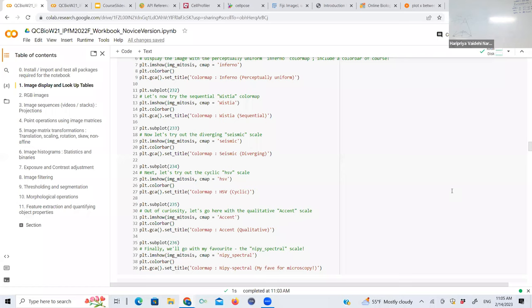Like if you wanted the pixel values to change, because sometimes in a pipeline, it's difficult to detect dark spots, but you can detect bright spots. So in that case, you do want to invert your image. In that case, it's okay, as long as you're doing work on other conditions. Yeah, you do it uniformly and you keep a copy of the originals.